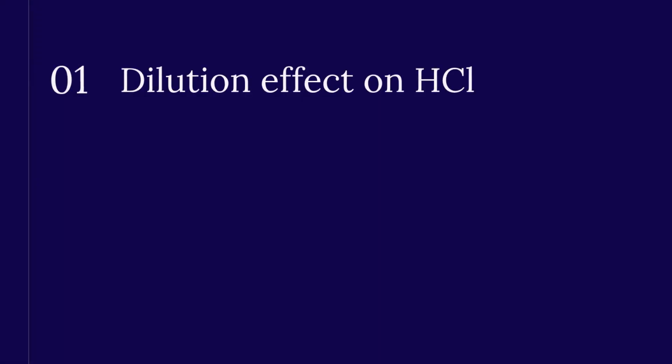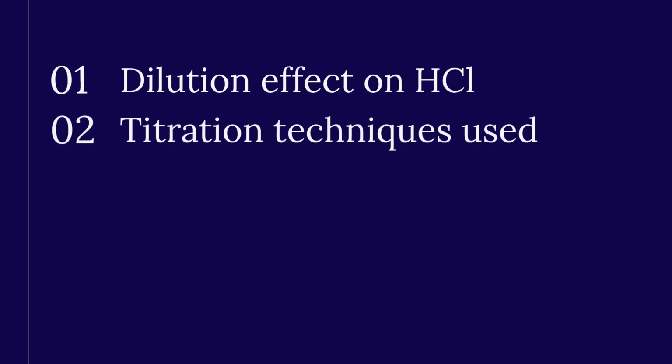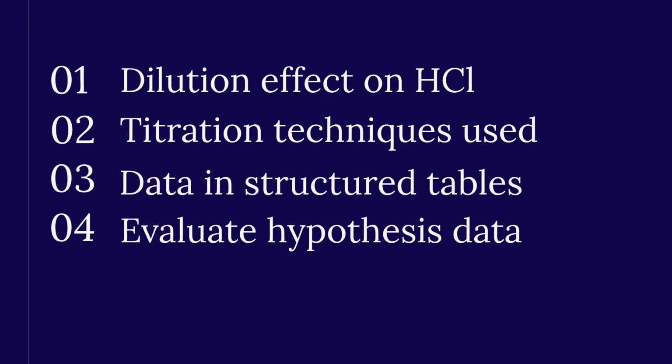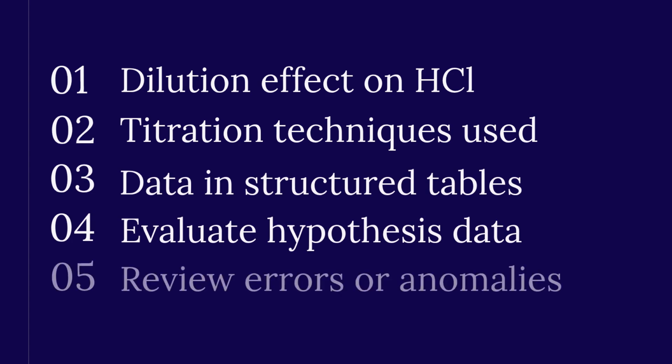Focus on the effect of dilution on hydrochloric acid. Use titration techniques for accurate results. Record all data in structured tables. Evaluate your hypothesis with collected data. Review any errors or anomalies encountered.